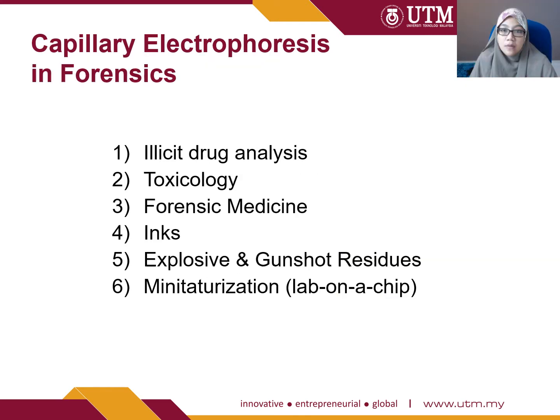Okay, to grab your interest on capillary electrophoresis and how it is used in forensics, I'll give a brief introduction on how people apply CE in forensics.